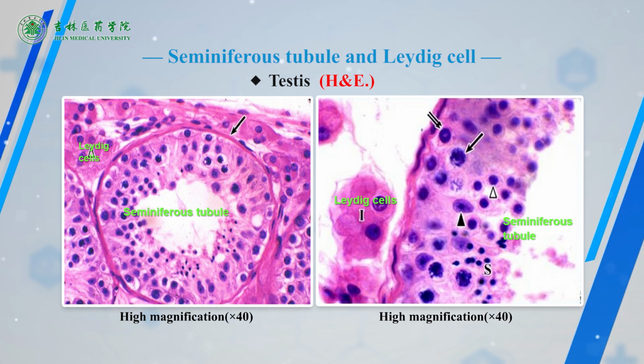Primary spermatocytes, about 2 to 3 layers, lie inner to the spermatogonia. They are large round cells with large vacuolar nuclei. The cells are often at the stage of meiotic prophase. The nuclei typically show chromatin that is in the process of condensing into chromosome forms, and the nuclear membrane gradually disappears.